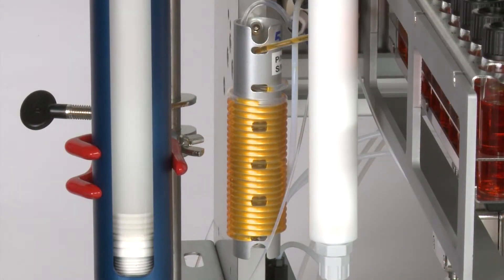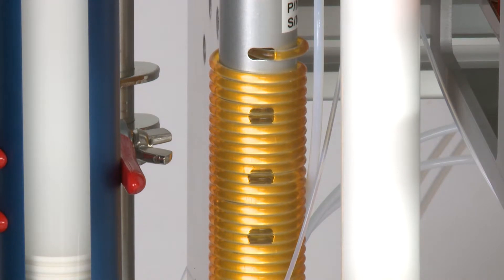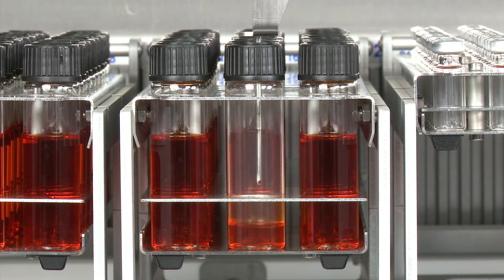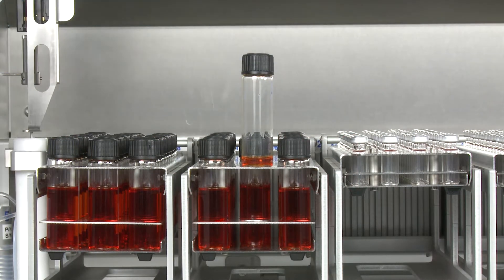We've also paid attention to the sample loop, which is reflected in its design. For the quantitative transfer of a sample, the sample container will be efficiently rinsed, and the sample is loaded into the sample loop ensuring that no losses occur.